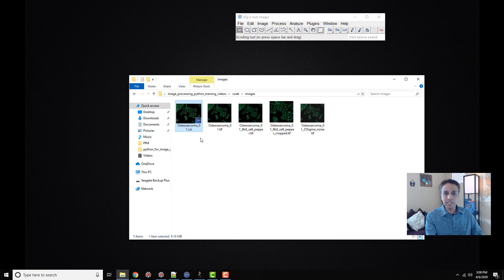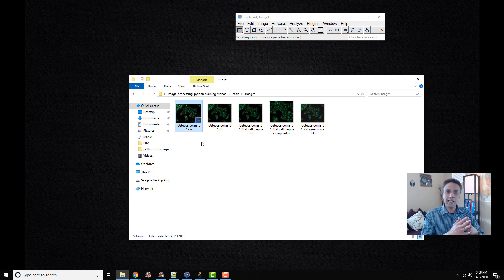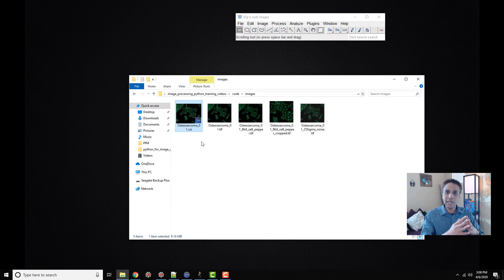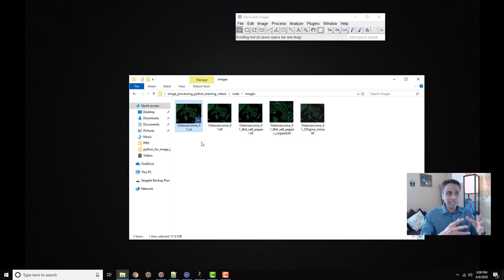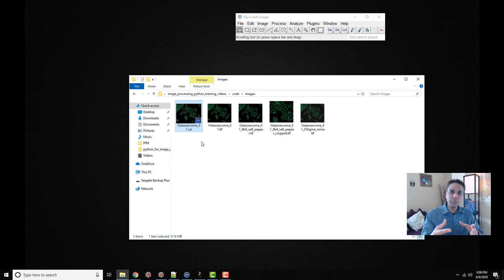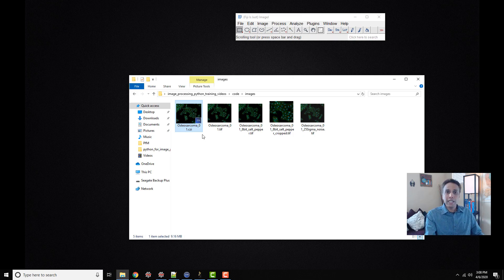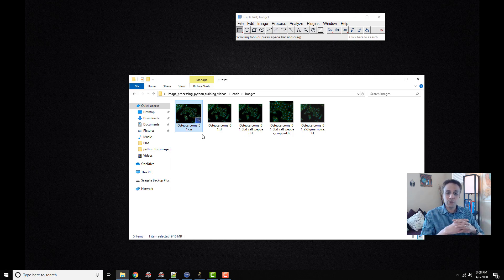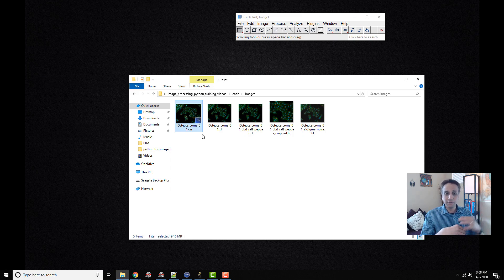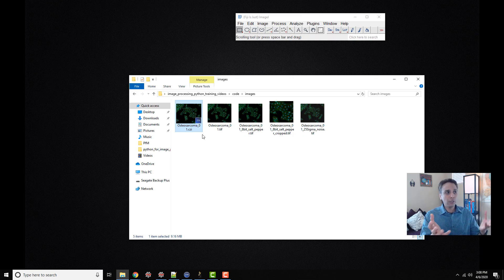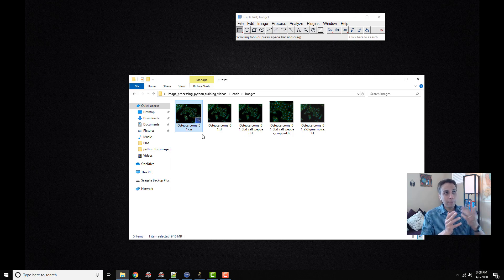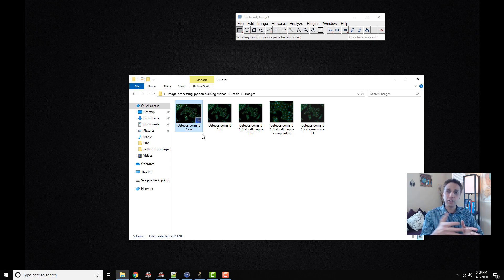CZI is the Zeiss file format, and I recommend working with the native image formats as much as possible because Zeiss puts a lot of effort into packing the right metadata that's useful for better handling your images. We do understand that you can change the file formats because maybe the software platform you're using cannot accept that file format. In Python, you can read CZI images. ImageJ can also read CZI images.